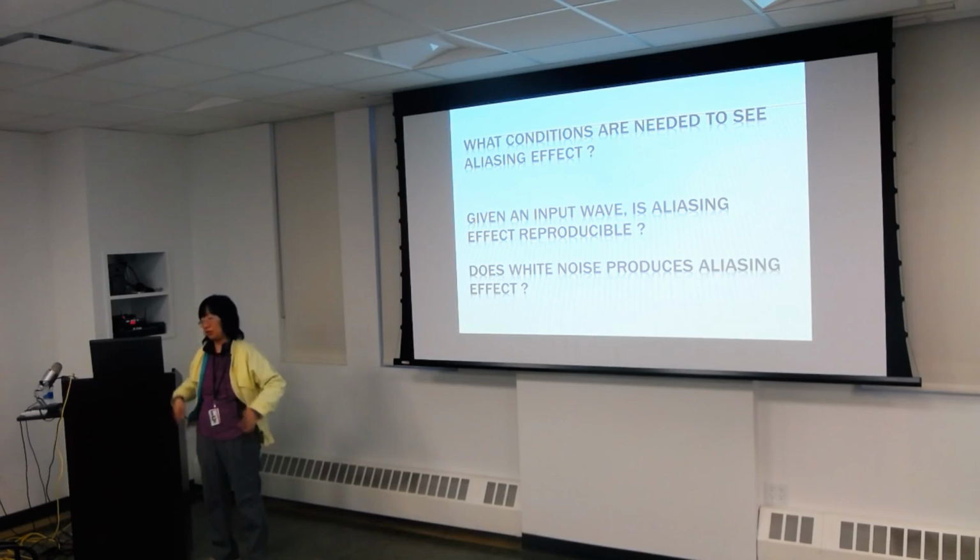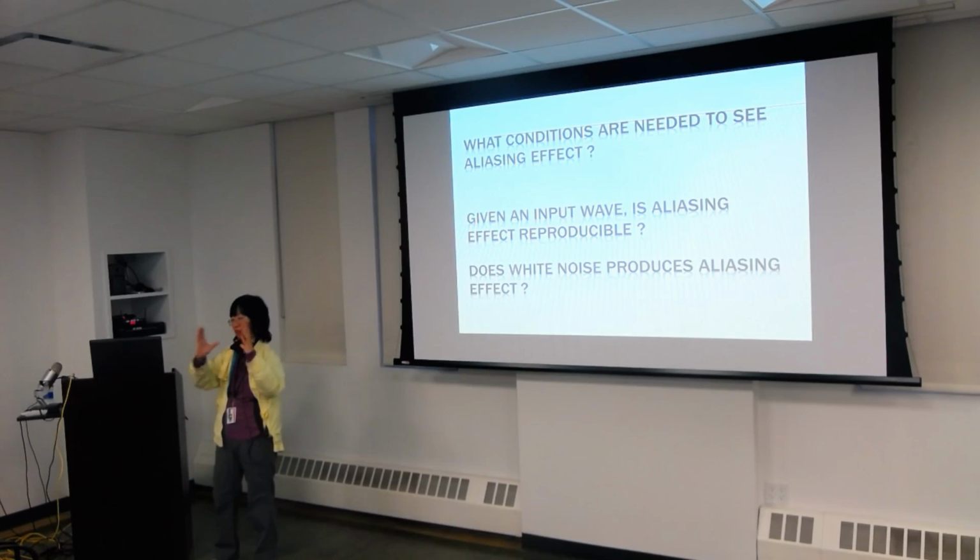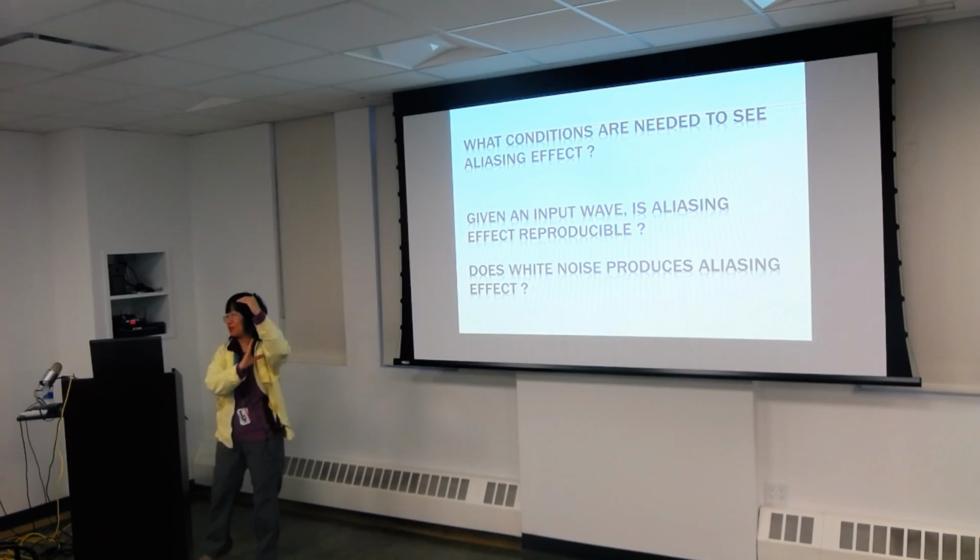Mathematically it's still something, right? If I have a detector that I'm only looking at at a lower frequency part, do I end up with all those frequencies piled back in, so that my noise keeps going higher and higher as I go to a lower frequency? Does it do that or not? It depends how much the noise is contributing over the signal. That's one way to look at it.